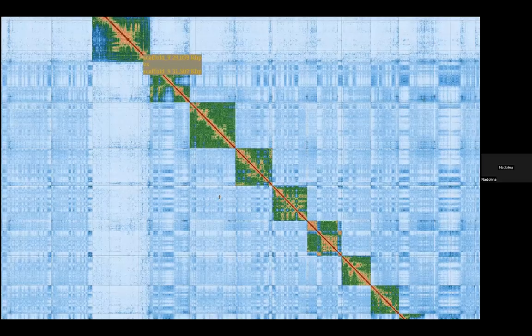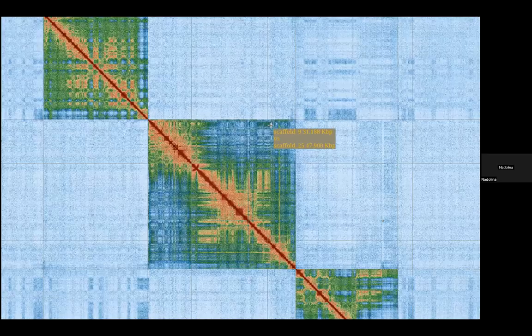And I think there actually is here. So we can see if we can find that PAR. If you want to double check that the coverage also dips here, you can generate what are called tracks. They're basically just like characteristics, like you would see in IGV, it's just characteristics of the genome, metrics of the assembly. And if you have those injected, which again, there are resources for it, and I have attached all of them into this slide.